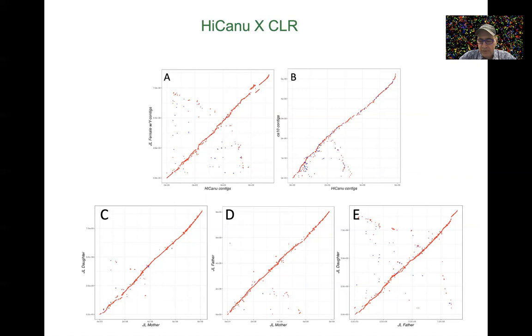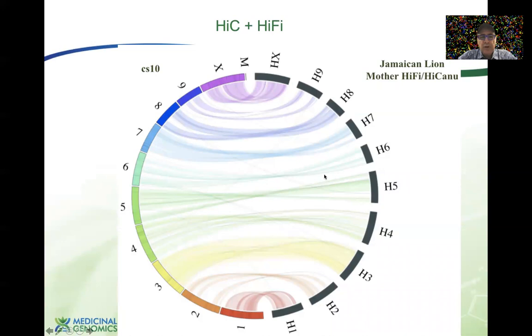Okay, so you can again run these Circos plots to have a look at how the references are lining up with CS10, and you can see there's a lot of synteny here. There are a couple of crossover points that might be real biological differences or assembly misassemblies that we're trying to comb through at the moment, but not much is known about the diversity of these plants, and so it's quite possible these are in fact real biological differences.